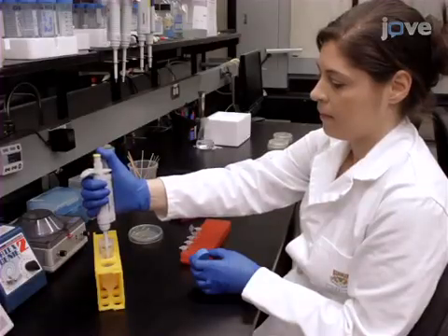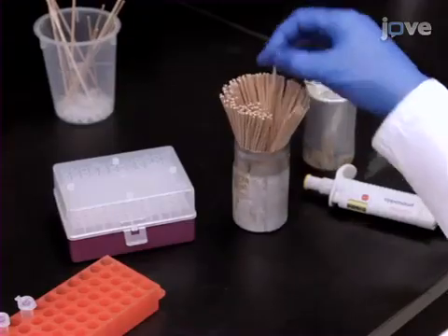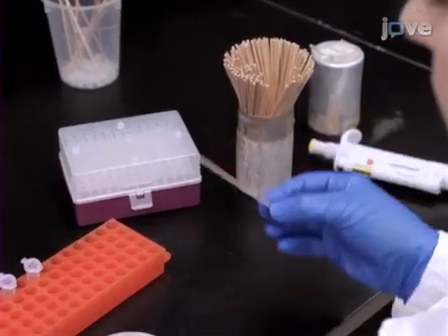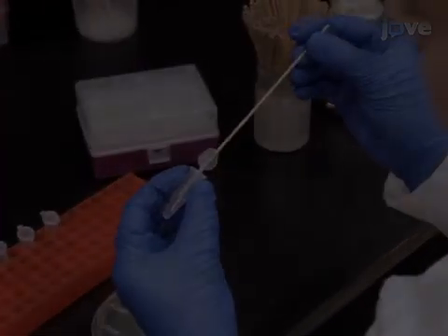Add 75 microliters of sterile distilled water to a 1.5 milliliter microcentrifuge tube. Using a sterile culture stick, pick up a small amount of bacteria from the heavy overnight streak and swirl the bacteria in the water.